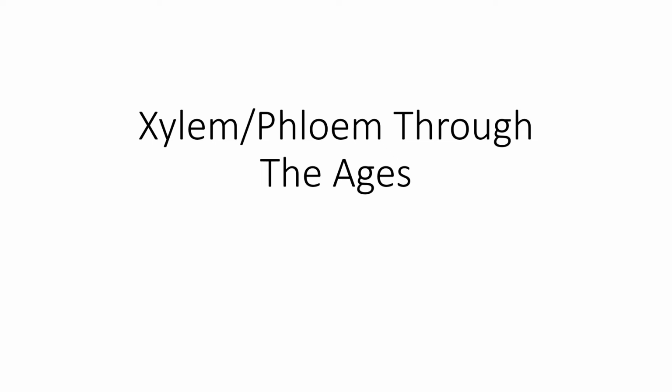Alright folks, this week in lab we looked at vascular tissue of a few different plant groups. And so I want to go over those slides real quick. Hopefully everybody saw the correct things on them. I know it can be a little tough to grasp, and this is stuff you're covering in lecture too, so hopefully you get some nice synergy here. And it will help you succeed in both the lab practical and the plant test coming up very, very soon. So without further ado, let's get into it.